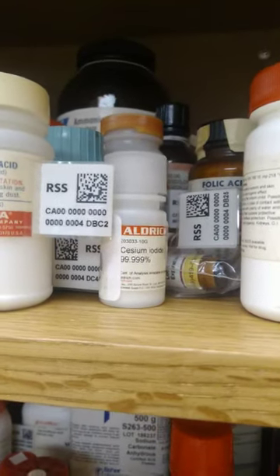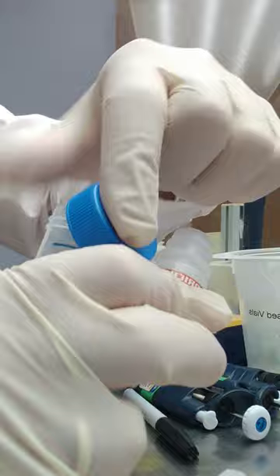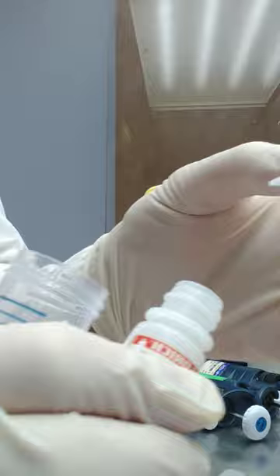Using cesium iodide to calibrate the mass spec. I just use a pipette tip to grab a tiny, tiny bit of cesium — almost nothing, just a few grains — dissolved in 50% isopropanol and 50% milliQ water. Start with the instrument on and running.